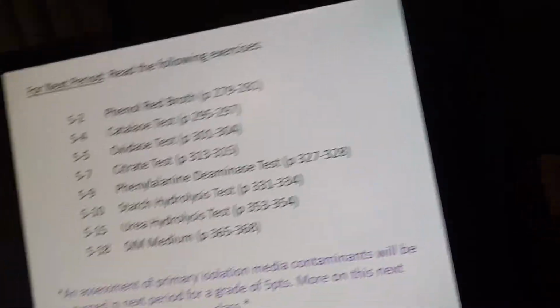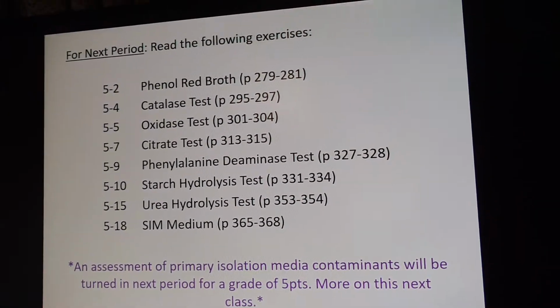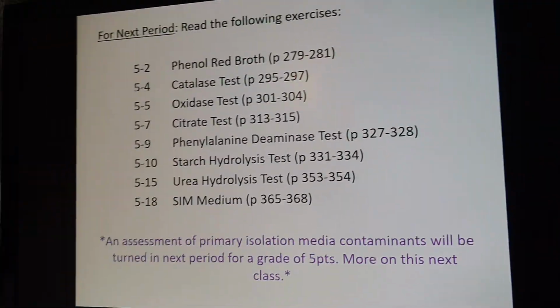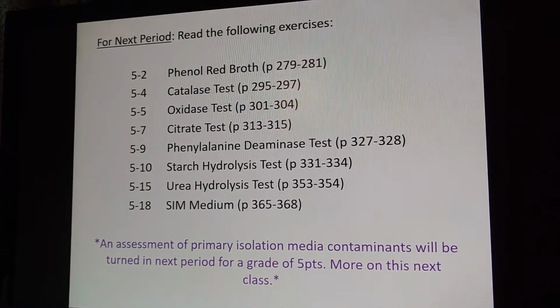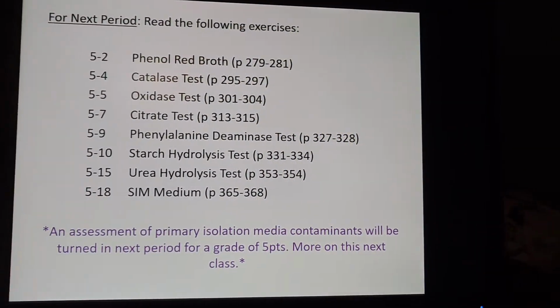Your E. coli spot shouldn't have grown, right? But something's growing there, so it's contaminated. It's likely contaminated with either the staph or the strep bacteria. Based on some properties of staph and strep, you should be able to figure out which one it is. We'll have to address how we're going to assess that.